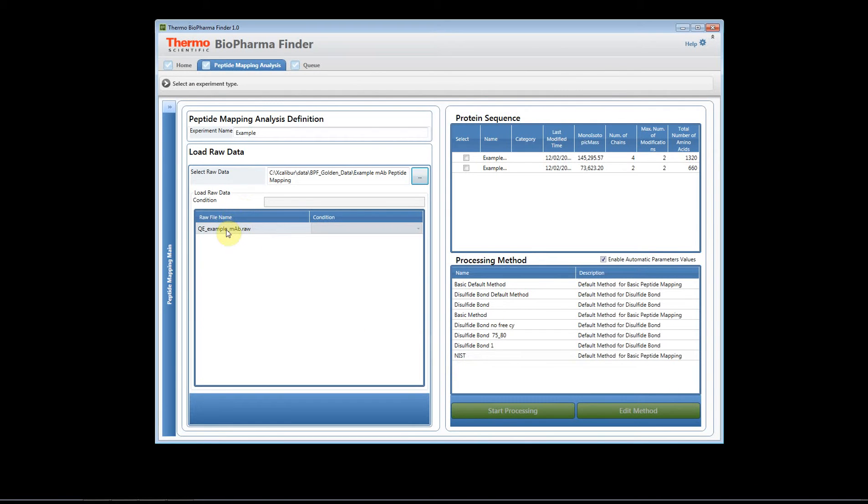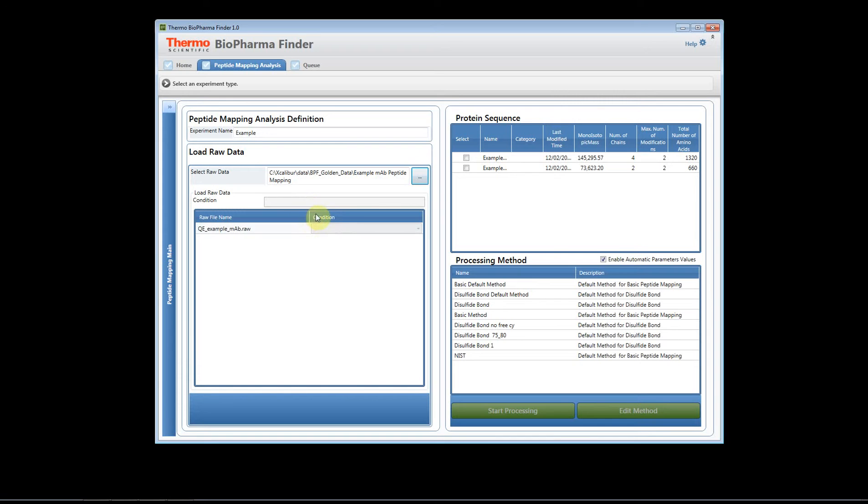Now if we have more than one file, which I will also do another help video to show an example where we do a comparative analysis, you'll actually be able to assign the different conditions for the raw files.